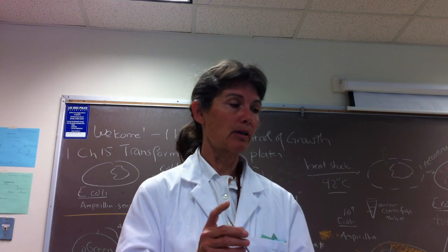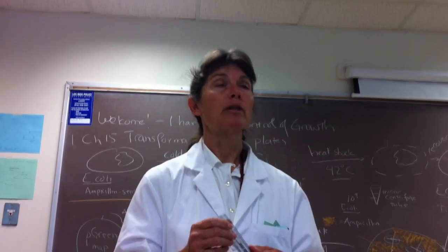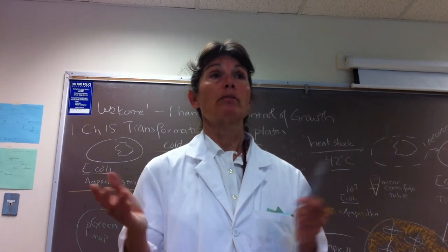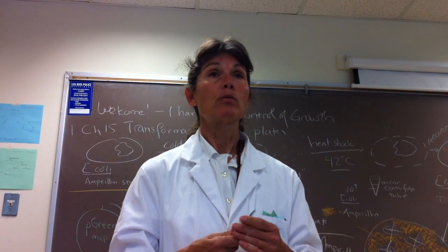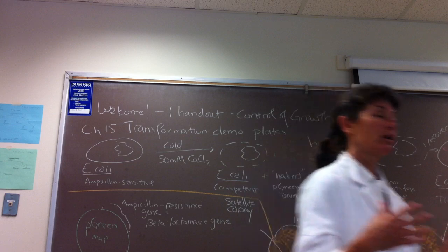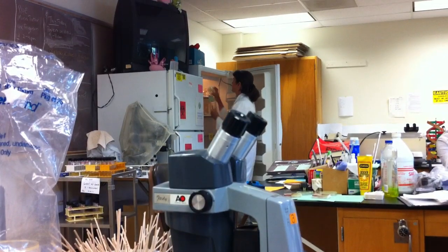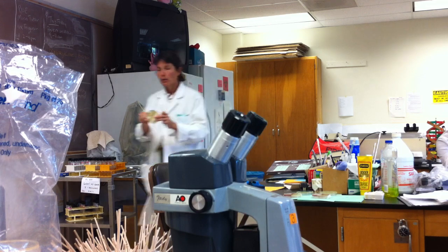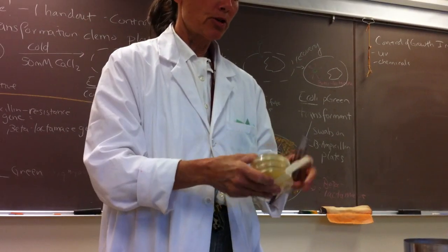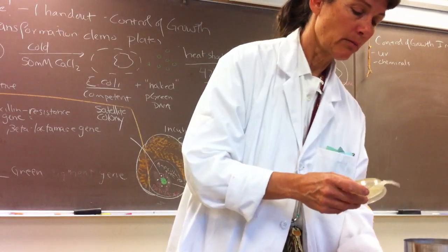So you'll recall the second part of the experiment was to compare different household antiseptics and disinfectants with their ability to inhibit or kill 2 different bacteria. One was a gram-negative bacteria, Enterobacter aerogenes. The second one was a gram-positive bacterium, Bacillus subtilis. Now, the way we're going to compare the effectiveness of our antiseptics and disinfectants is I'm going to go ahead and borrow some of your plates. We're going to have you pull the disc diffusion plates, and we're going to have you measure the diameter of the zone of inhibition and record it in millimeters. Okay, so that's important. We're going to record it in millimeters.